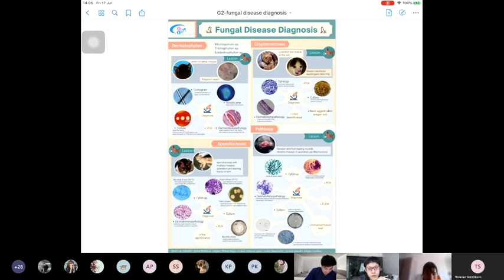And I have a question about GMS. About Gomori methenamine silver staining, what composition and structure of Pythium does the GMS stain?